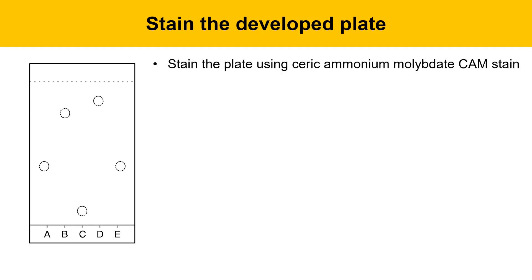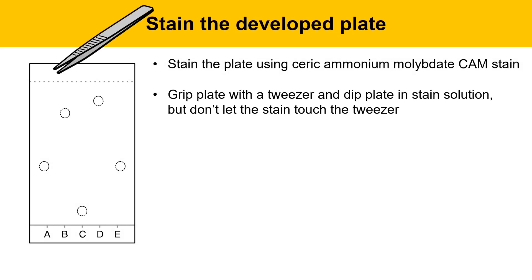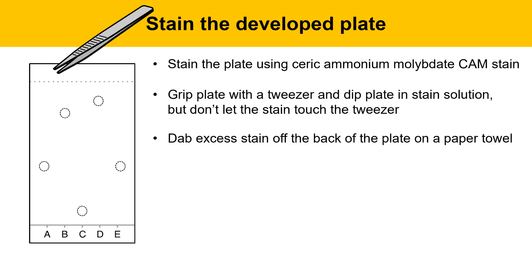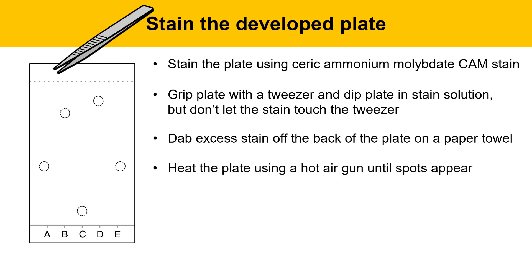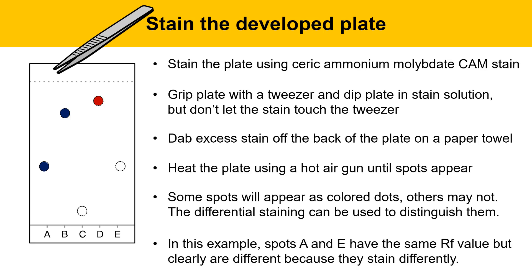Next, we'll stain the developed plate using a ceric ammonium molybdate, or CAM stain. This can be useful for distinguishing spot types, as some spots stain differently. It's particularly useful when RF values are very close — for example, if the top two spots have a very similar RF value, different staining helps distinguish them. Grip the plate with tweezers and dip it in the stain solution, but don't let the stain touch the tweezers — only dip up to the dotted line, because touching the tweezers can catalyze a reaction that turns the entire plate blue. Dab excess stain off the back with a paper towel, then heat the plate with a hot air gun until spots appear. Some spots turn blue, another may turn a rusty red-brown color. This differential staining can be used to distinguish them — spots A and E having the same RF value but different staining colors confirms they are different compounds.